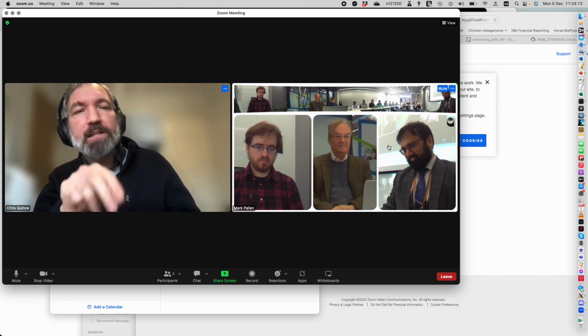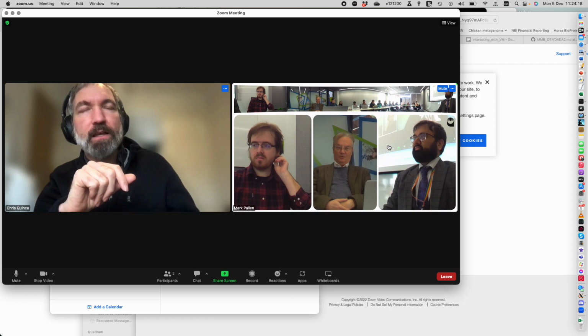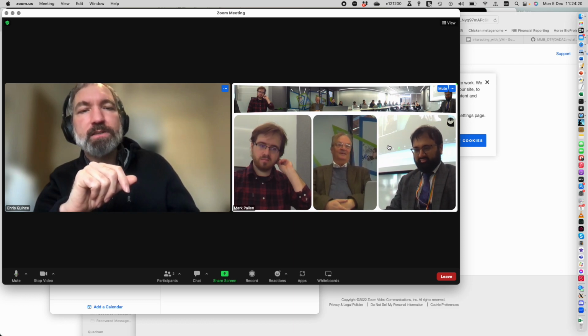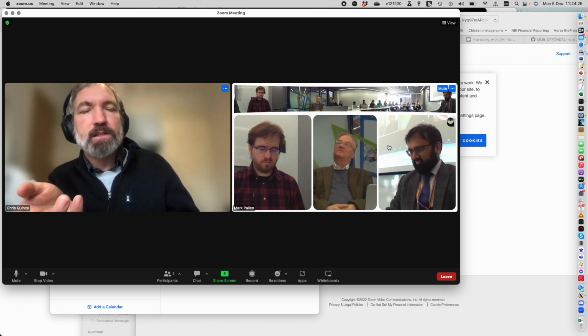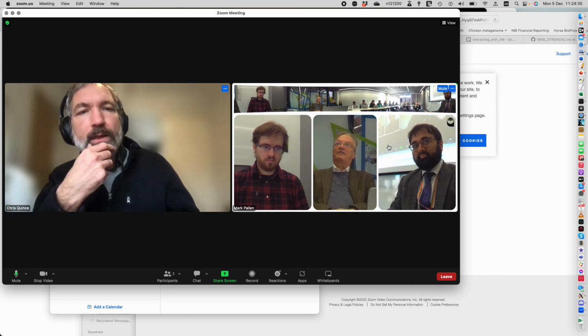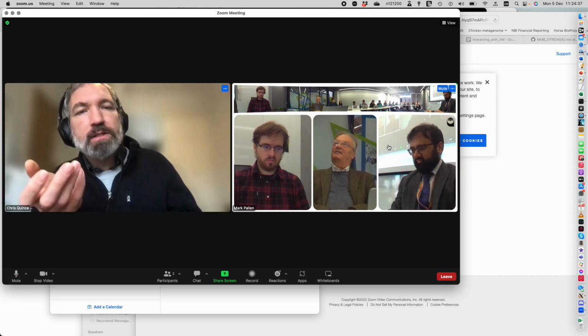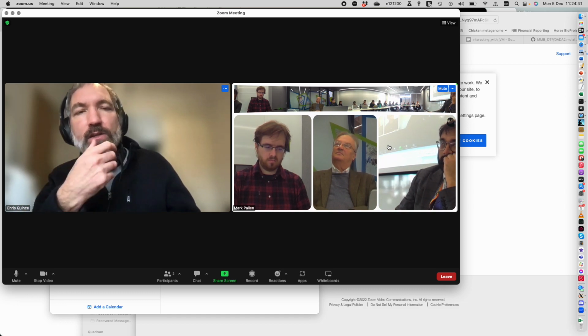Actually, Mark, that is something that's raised by almost every collaborator I ever have. Do we need to actually do 16S? And I'm like, yeah, why not do 16S? You can analyze 16S reads in an afternoon. It will take us months and months to analyze your metagenomes. Yeah, but 16S won't tell you anything about function. Obviously, it's limited, and we'll talk about that this afternoon, but it's still a useful technique.